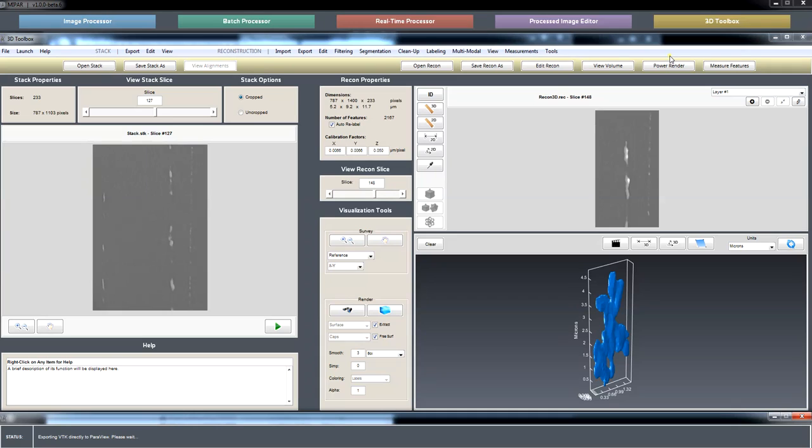I think I cover that in the visualizing 3D reconstruction tutorial. I show you where to put the ParaView installation. I think that the problem here is that I'm exporting this VTK across to our network server, so that's why it's taking a little bit of time. But yeah, that VTK will export and then it'll open directly into ParaView. That's the idea, yeah.